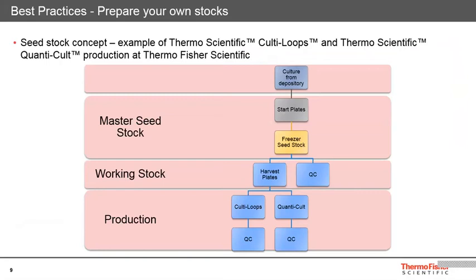After a minimum of 48 hours of freezing, we would pull one of the vials out to check the purity of the material, do biochemical analysis, and everything else that is generally recorded in the quality certificate of the final material. When you are making a frozen seed lot, you're also required to incorporate some form of QC checks of the stored material.